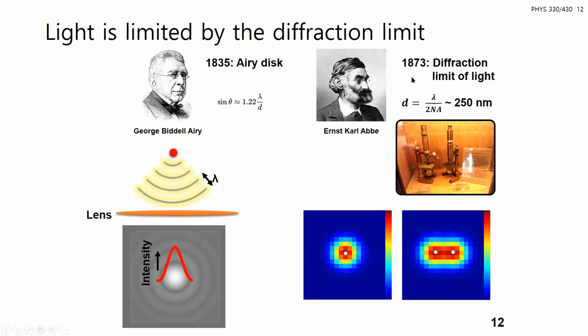lecture, and it's long been known since the 1870s, when Ernst Abbe defined this as the best that you can resolve with ideal optics: your wavelength divided by 2 times the numerical aperture of your objective. So with visible light, if you're using green light, that's going to be around 250 nanometers. So what that means is if you have a single molecule, a single fluorophore, a single green fluorescent protein or the like, you'll see the emission as this diffraction limited pattern, which is an Airy disk, which I've described here, so the intensity of a single molecule will be this blurred out spot.